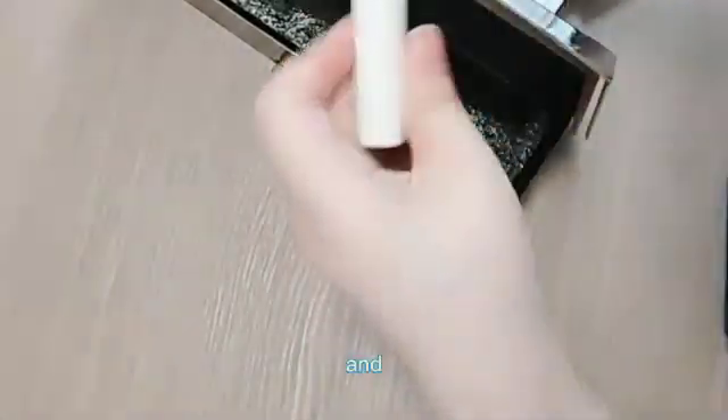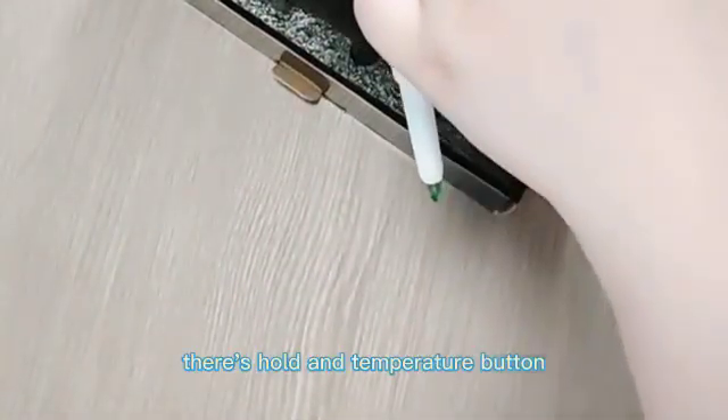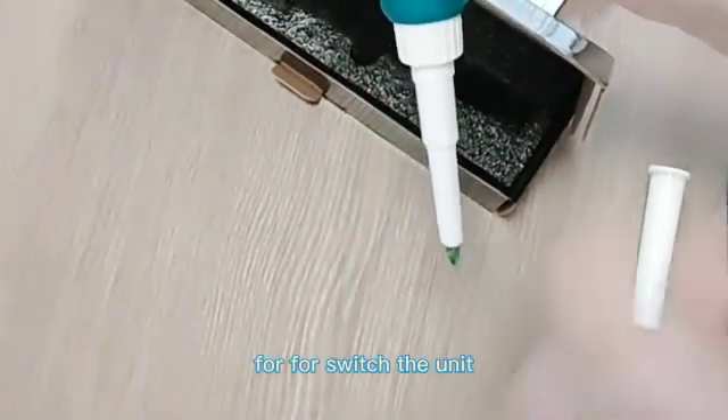Turn it on and you can see there is a Count button, a Hold button, and a Temperature button. The temperature button is also used to switch the unit.